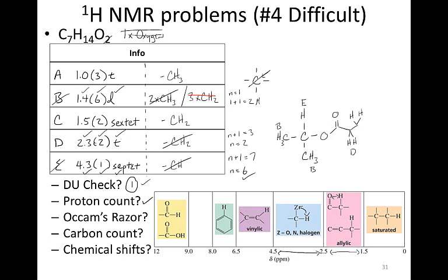So we'll go ahead and get rid of that. We'll get rid of that. And so now we only have protons C and A to work with. In the process of explaining away protons D, we hypothesized this extra methylene group, or this extra CH2 group. And this seems to work out really well with the tabulated data that we have. We have an extra CH2 here, so that seems to be okay.